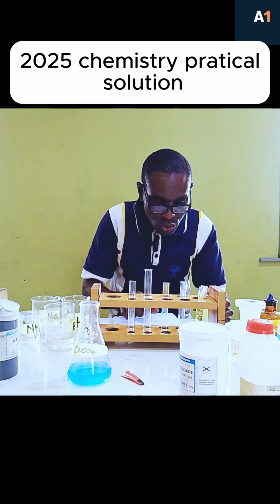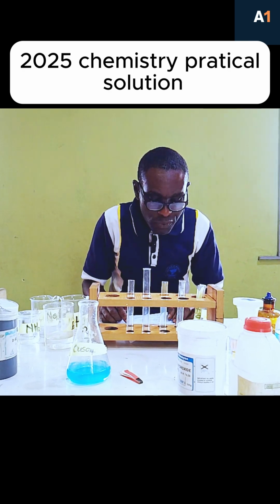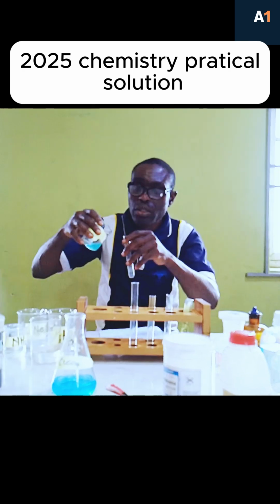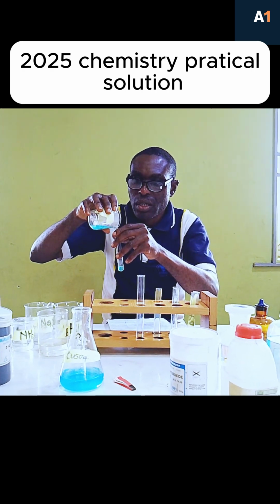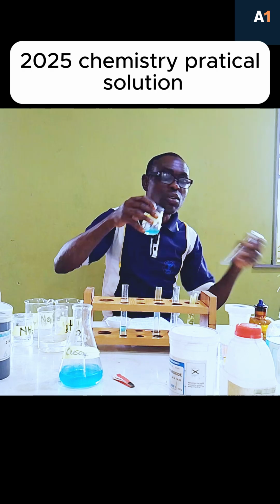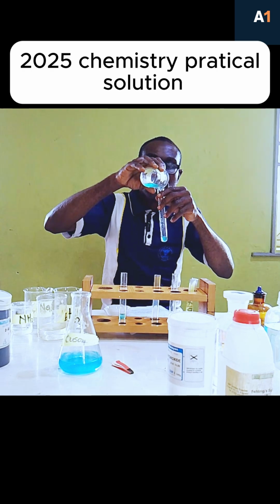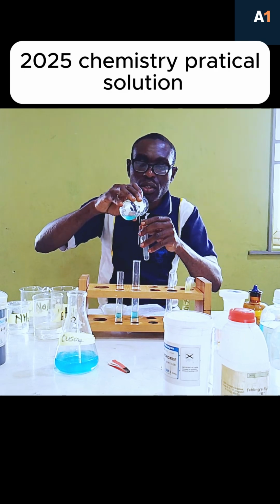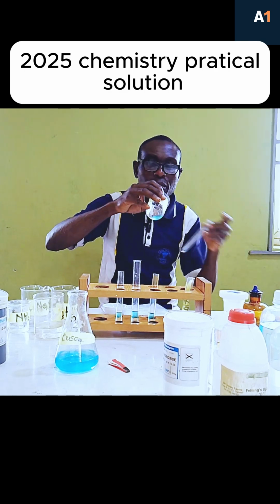So the second thing we have to do, after we've tested with litmus paper, is divide the solution into 4 portions. So it's what I'm doing now, into 4 portions. This is the first portion. We have to divide it into 4 portions. This is the second portion, this is the third portion, and this is the last portion.